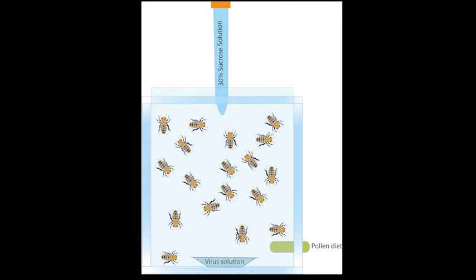And so here we're going to have a short video of Ed Shea, another graduate student who works in my lab, talking about an experiment he set up and how we put the virus inoculation into these cages and use them for lots of different experiments.